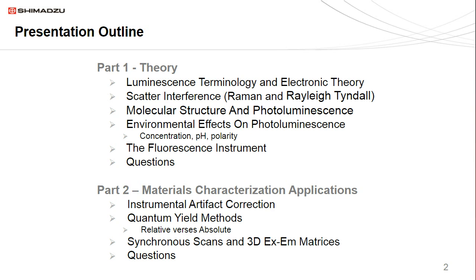Part two will deal mainly with applications. First considered will be the instrumental correction, which is necessary for the determination of quantum yield, and we'll look at both relative and absolute methods. Lastly, we'll look at synchronous scanning and how it relates to three-dimensional fluorescence spectroscopy.